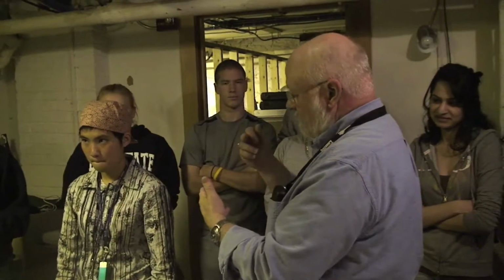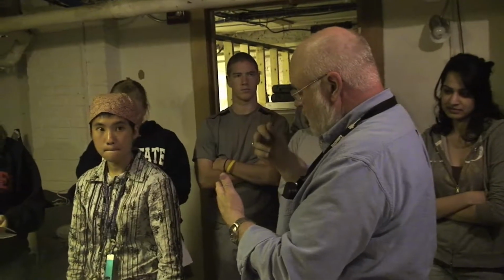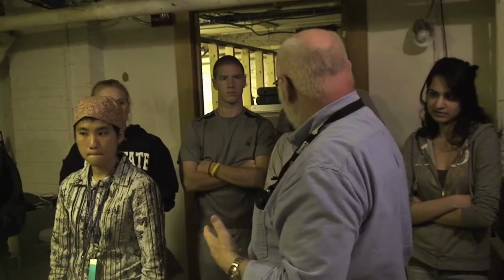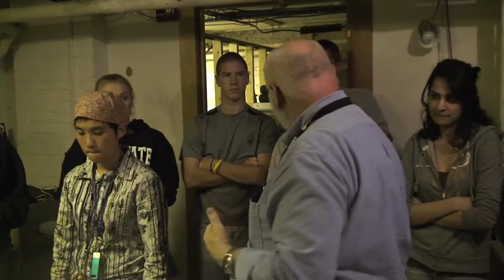So we're going to be doing DFO and ninhydrin, and we're going to be looking at a couple of different porous surfaces to look at fingerprints on them. You can use your own fingerprints just to make sure you have them, and we'll go through that process. All right, so the DFO reagent was made up yesterday, so it's fairly fresh.